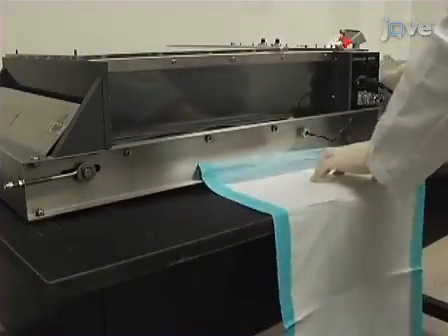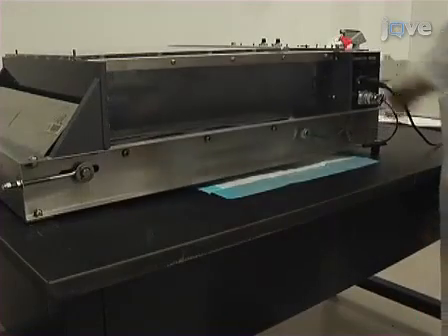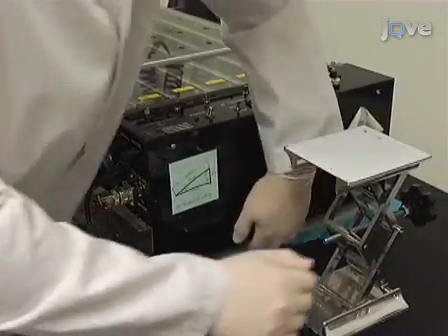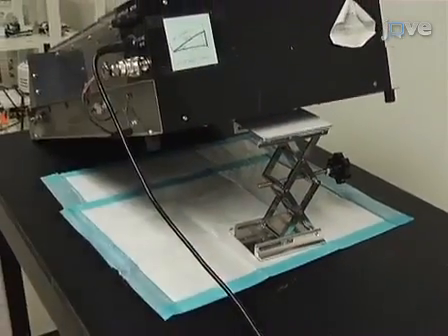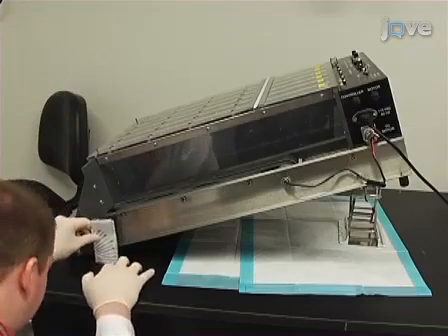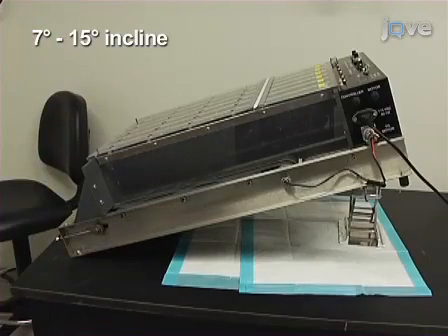To begin, place a tray or a blue lab pad underneath the treadmill to collect waste from the animals during the experiment. Next, set the angle of the treadmill surface. Some treadmills have an integral apparatus to adjust the incline, while others require the treadmill to be elevated through other means. A flat surface or an angle between 7 and 15 degrees downhill or uphill is generally used.